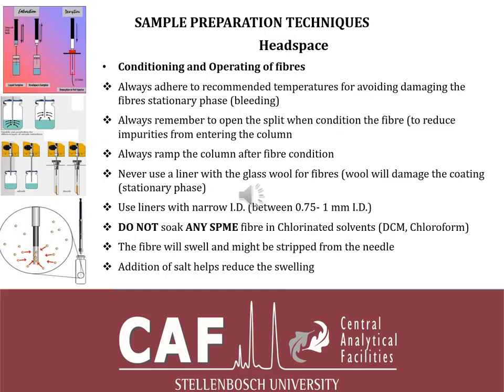Also, one of the things that one must never do: you must never ever soak any SPME in a chlorinated solvent like dichloromethane or chloroform, because they will definitely strip the tip of the fiber. The fiber will definitely swell and strip. The addition of salt might help to reduce the swelling.